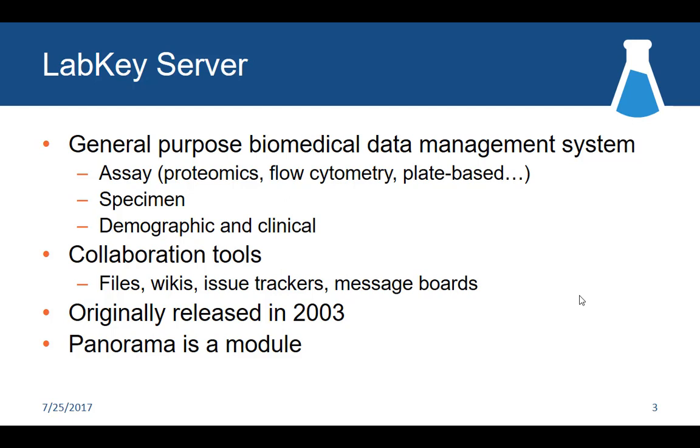And then some of the other things that make it interesting and compelling and kind of help give some context around the data that you're uploading are some of these other features like wikis or file shares. So if you do, say, a lab presentation and you've got a PowerPoint or a PDF, you can drop that in there too and have that in the same repository as your primary data itself.